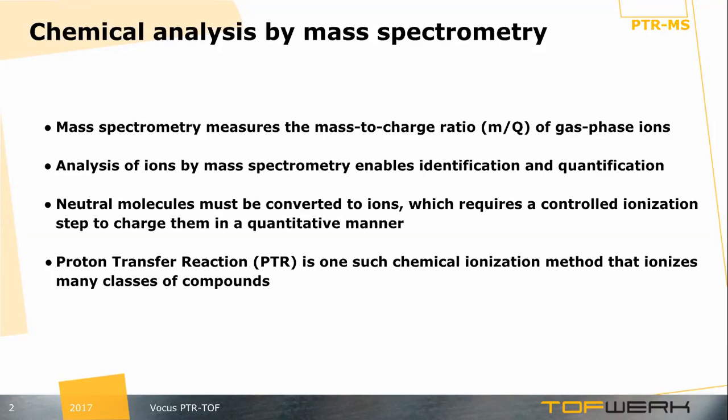Proton transfer reaction, or PTR, is one type of chemical ionization method that we can use to ionize lots of different types of compounds in a very quantitative and controlled manner.